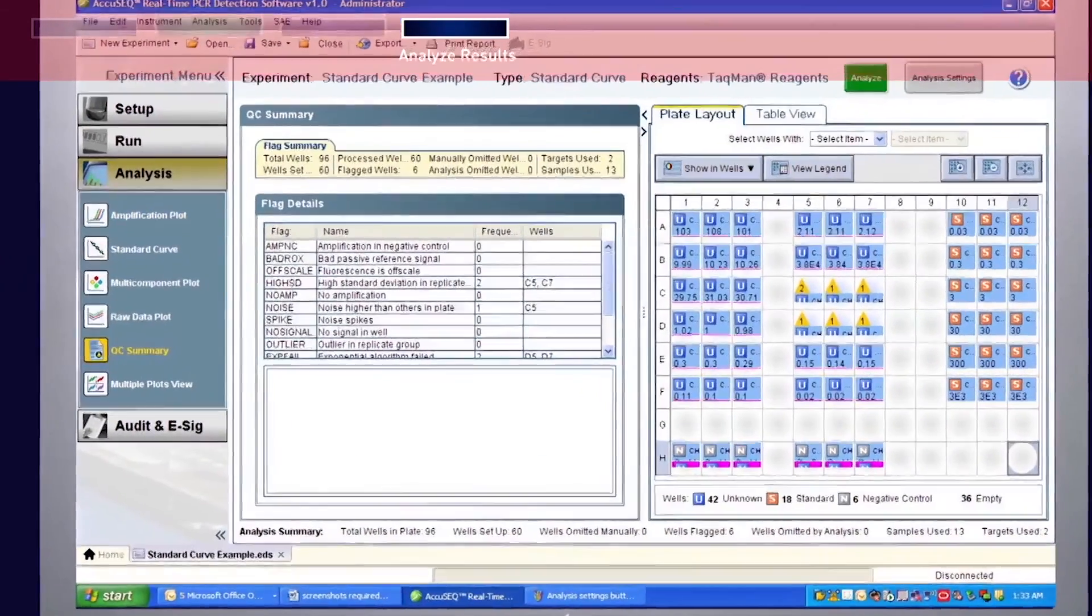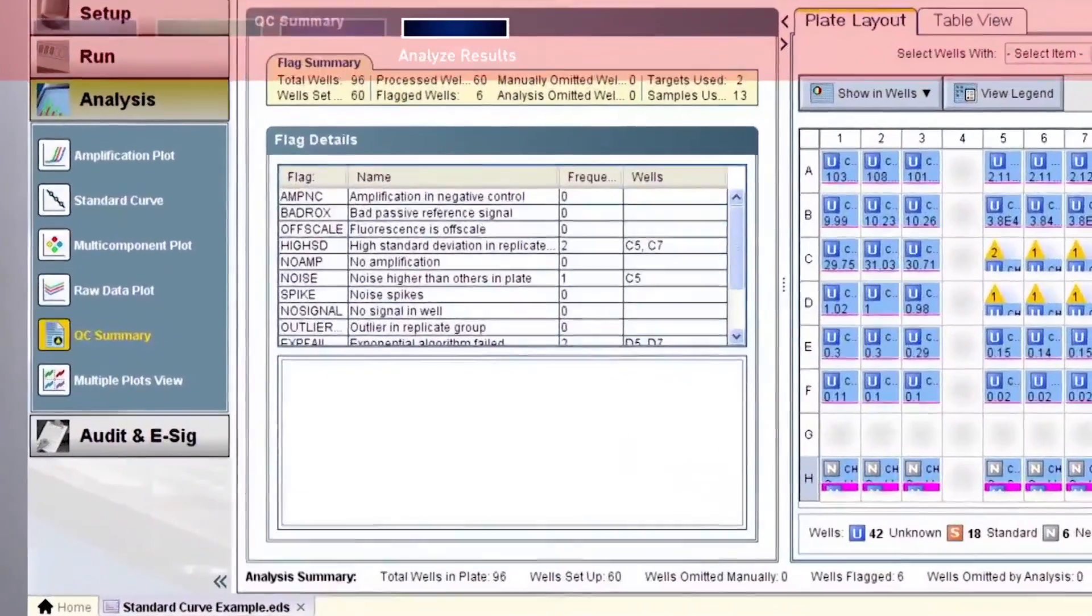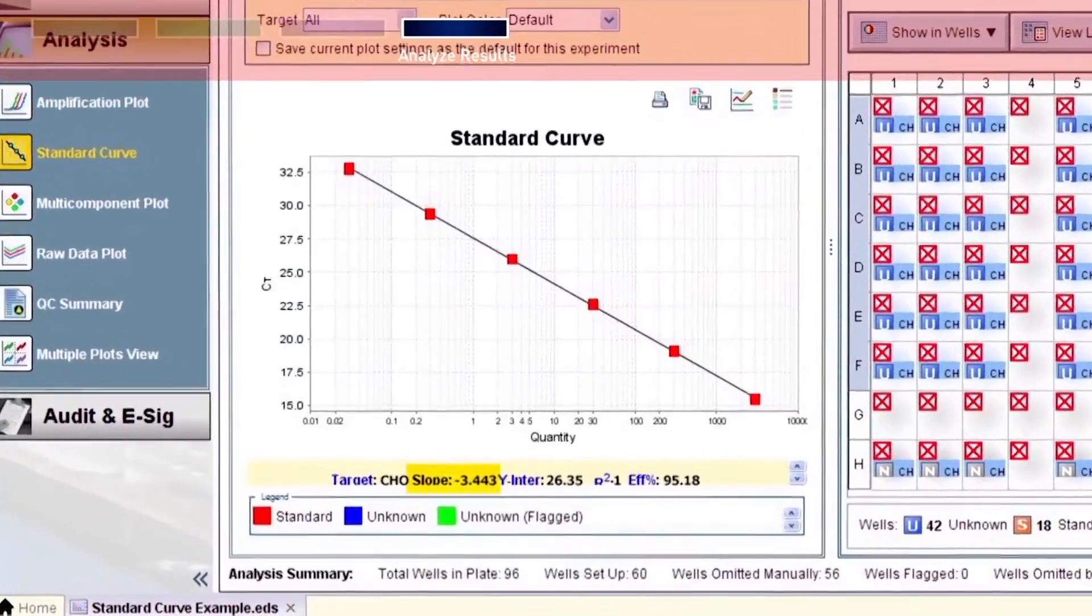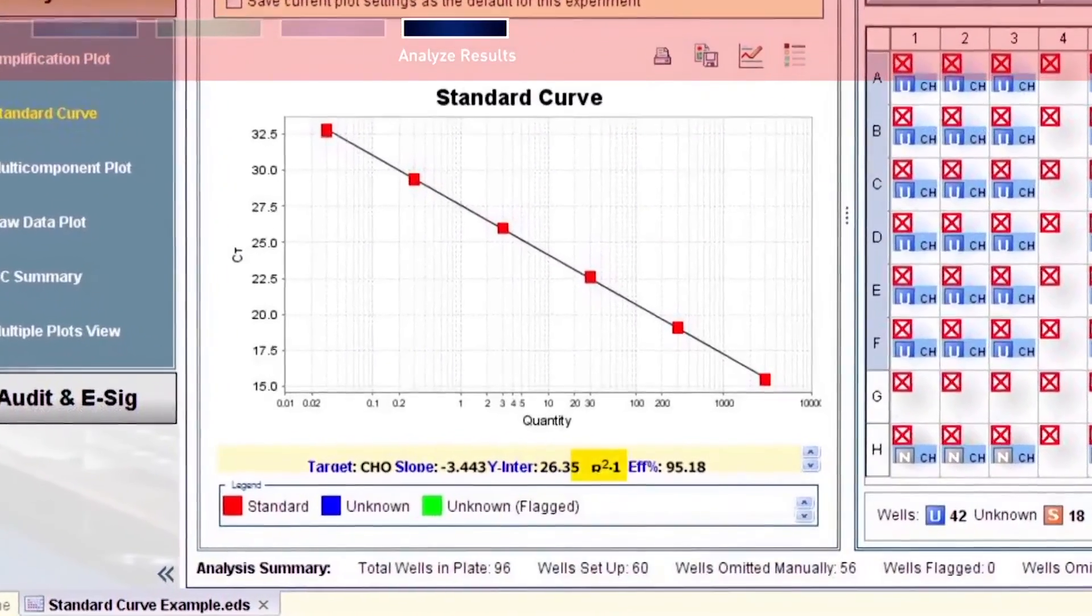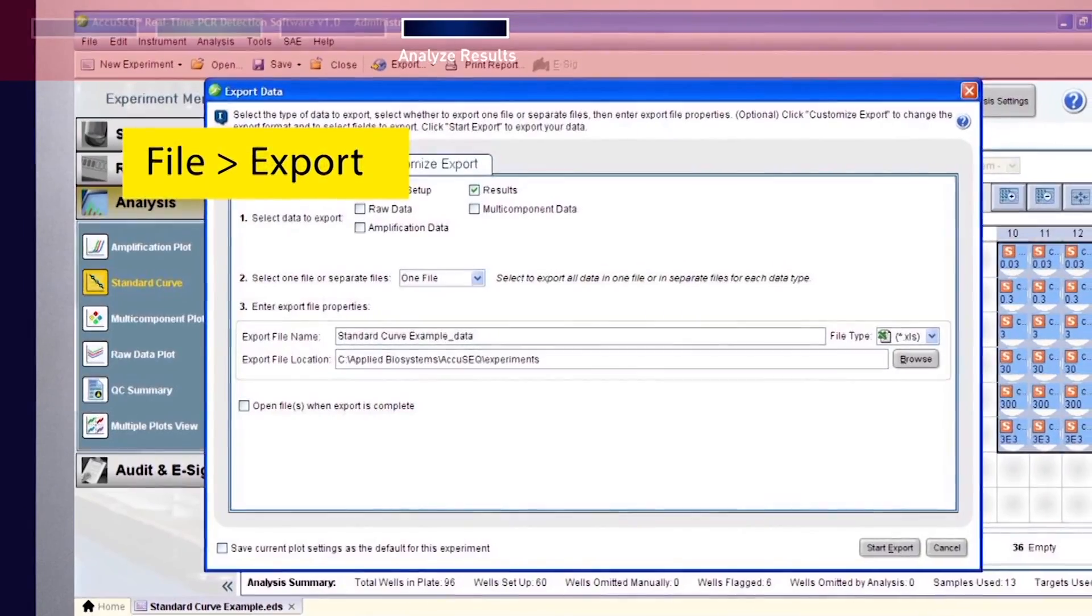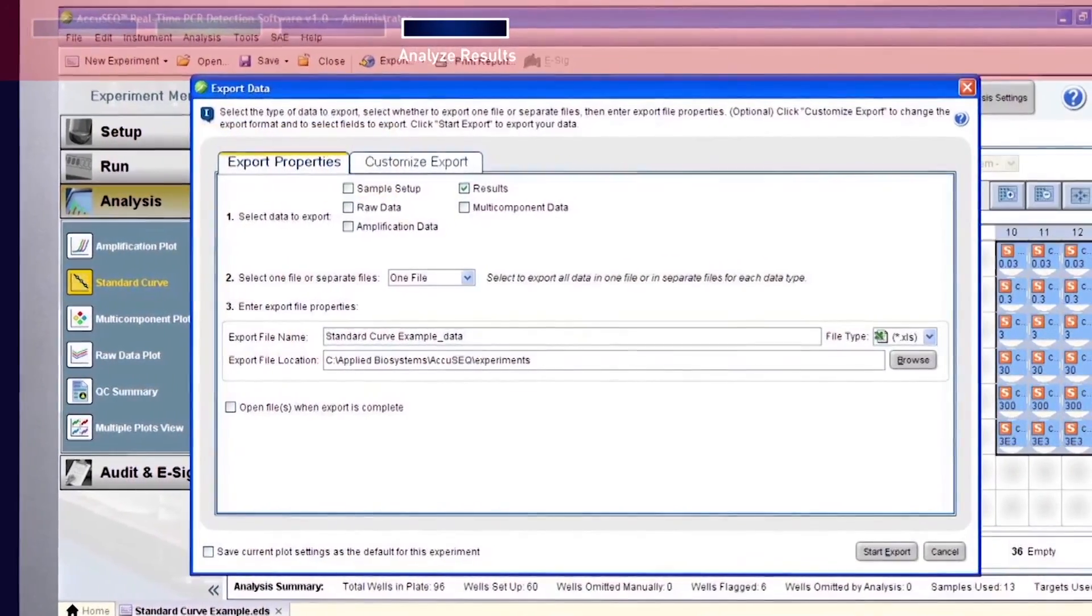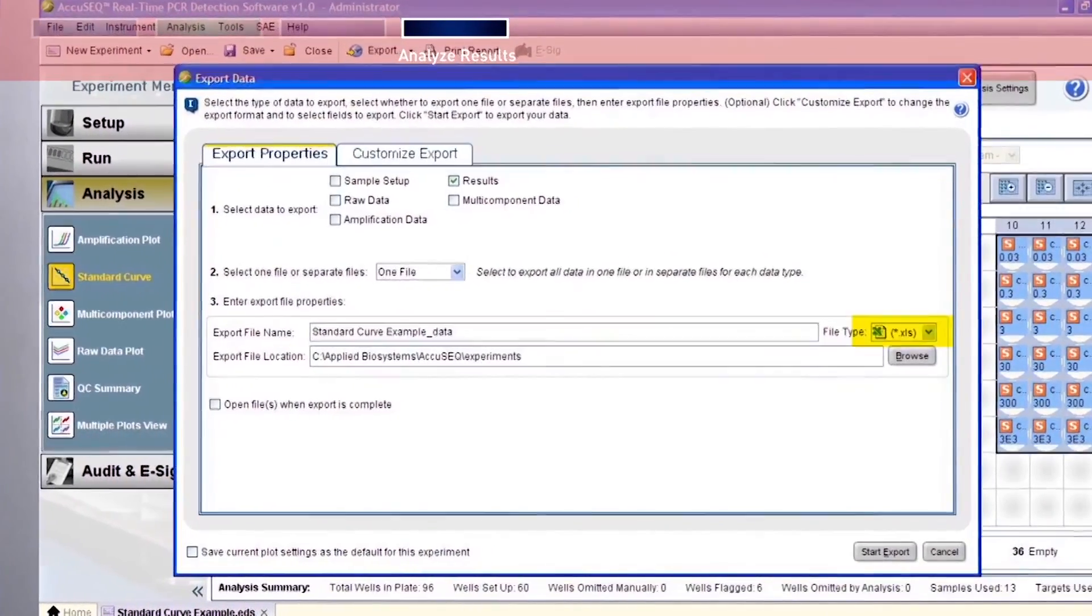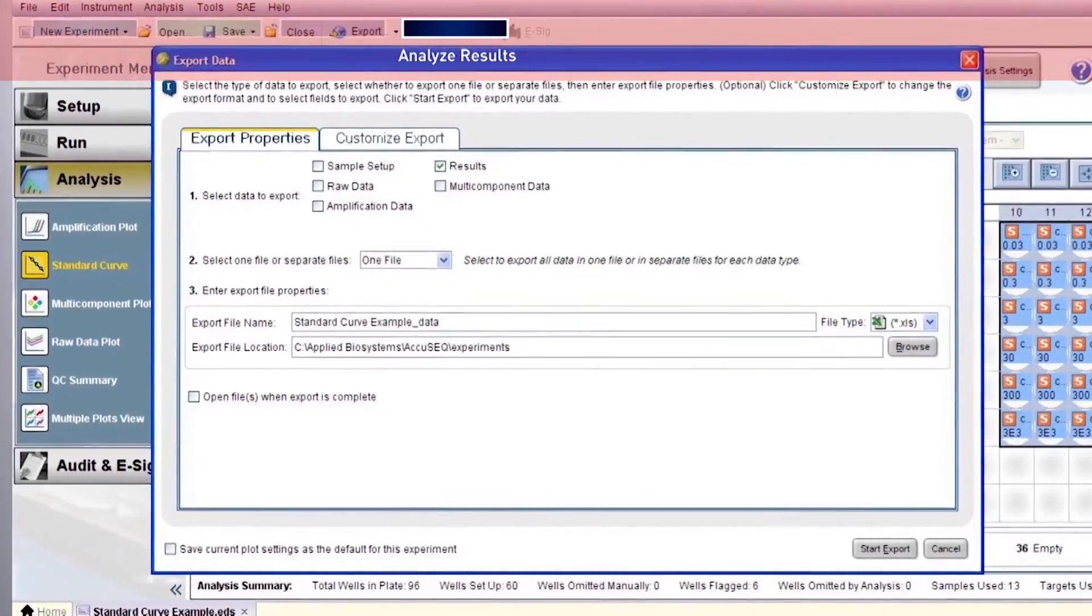Review the data and analyze the flag summary. Verify the values for the slope, intercept, R-squared, and efficiency. To export the database, select File, Export. In the export data menu, select file type XLS. Click Start Export.